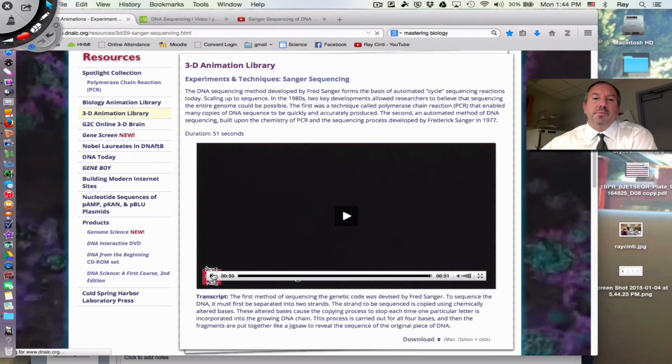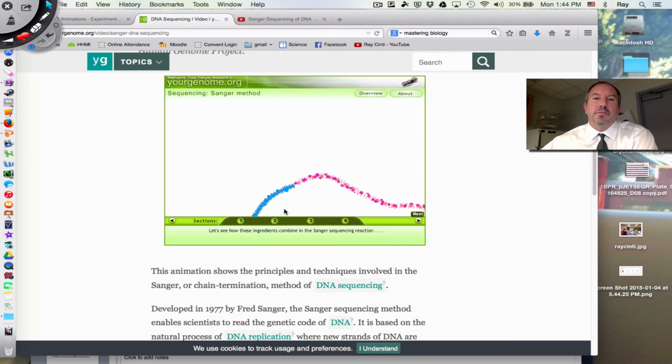So I find that to be particularly cool, but again, just staying with this, let me sort of just go with this. So again, I was mentioning in my lab we sequence redwood genes, and we ligate them into bacterial plasmids, and then we clone them in bacteria. And so then we go about purifying the plasmid and sequencing the plasmid. So this is going to show you a little animation of how sequencing a plasmid takes place. So let me push this here.